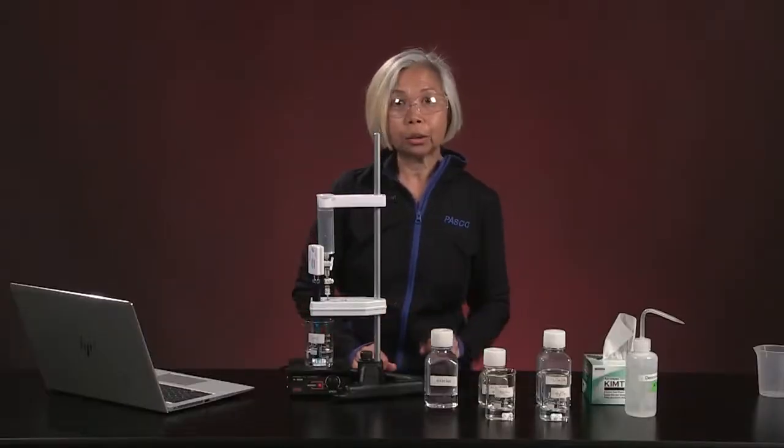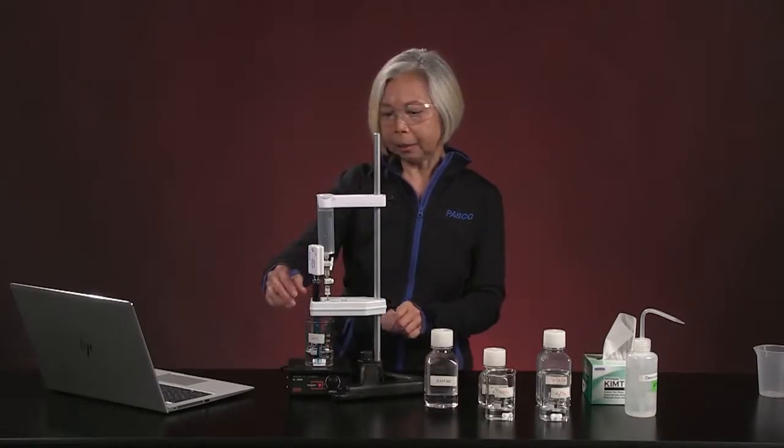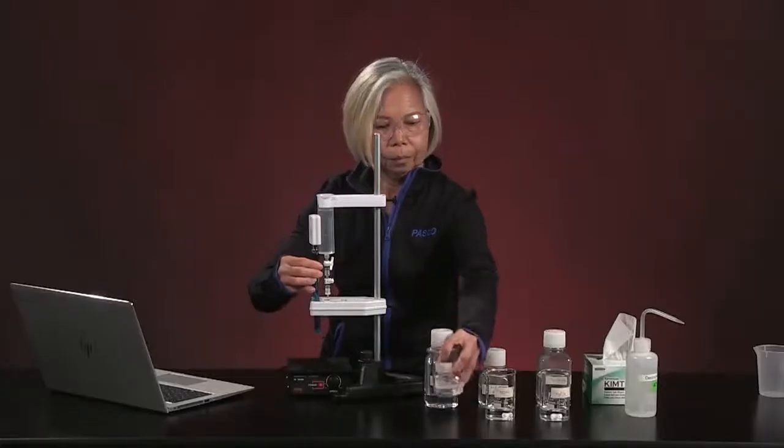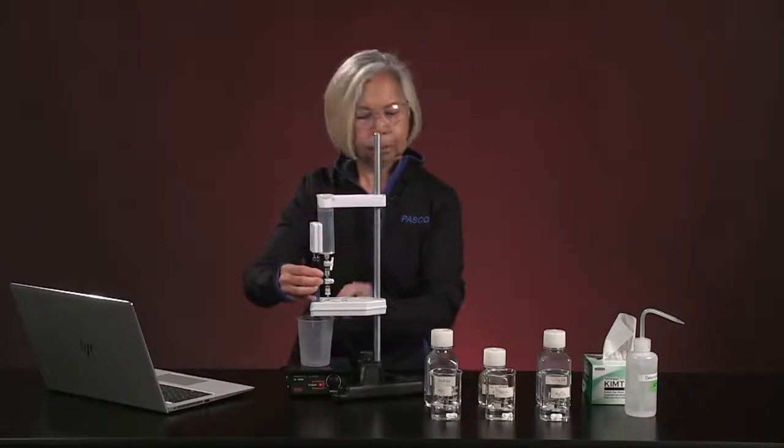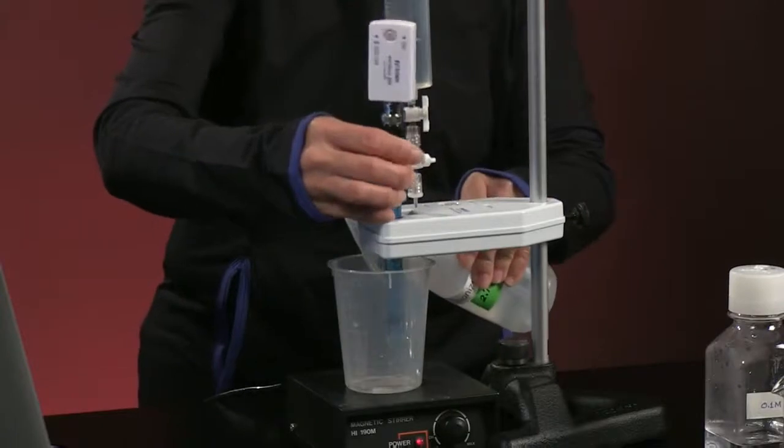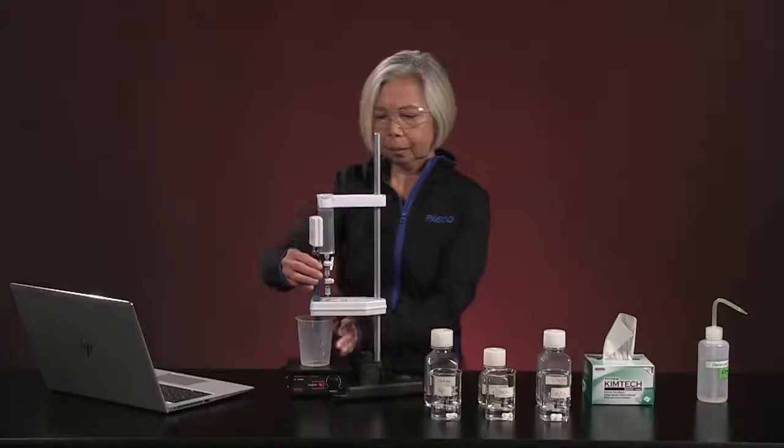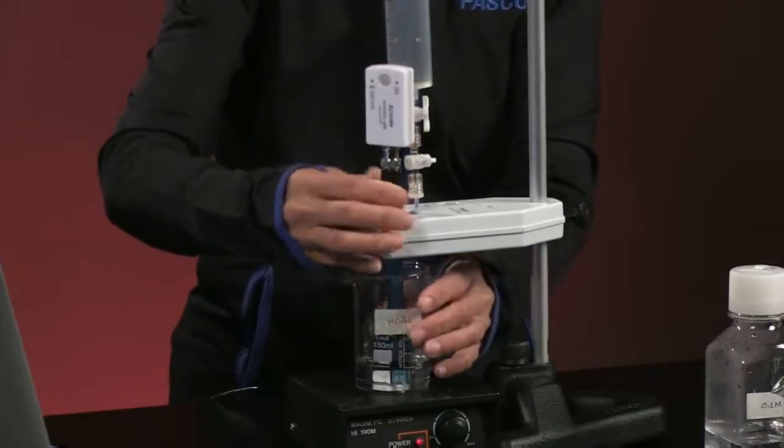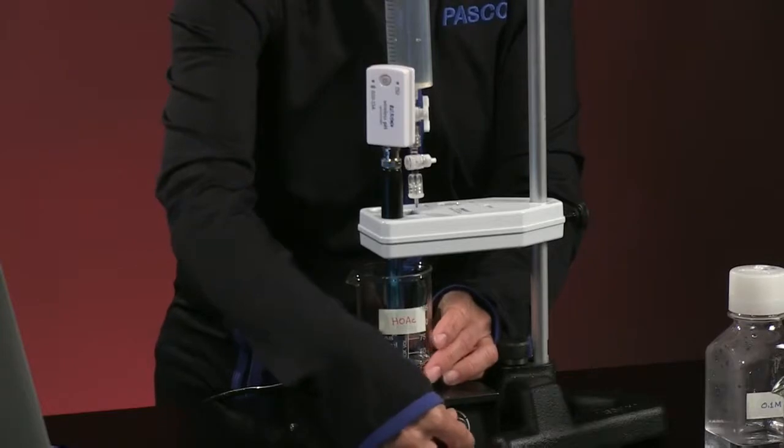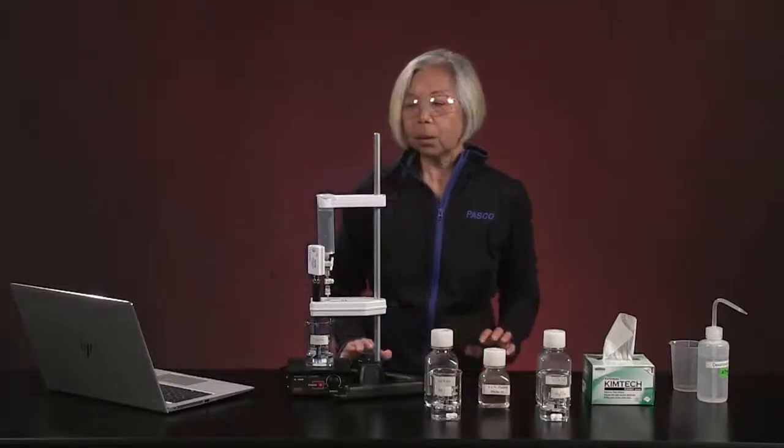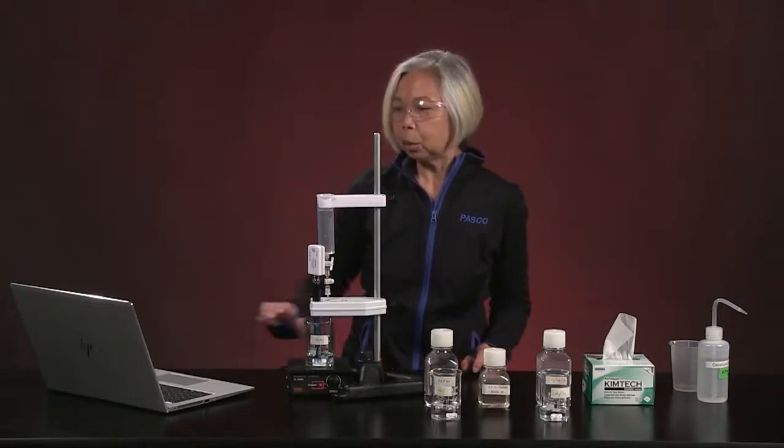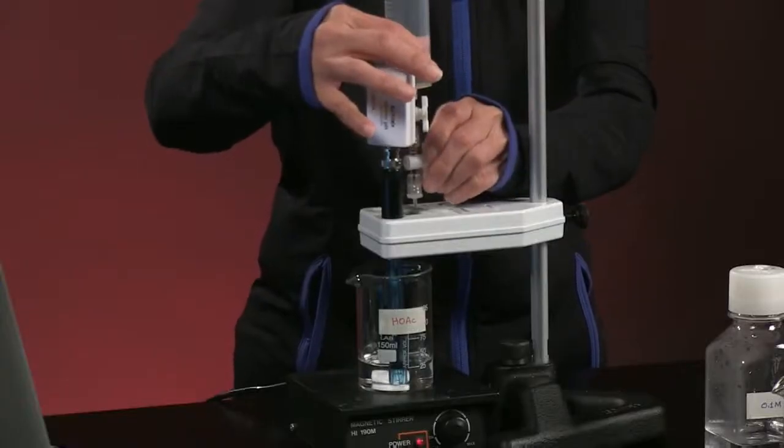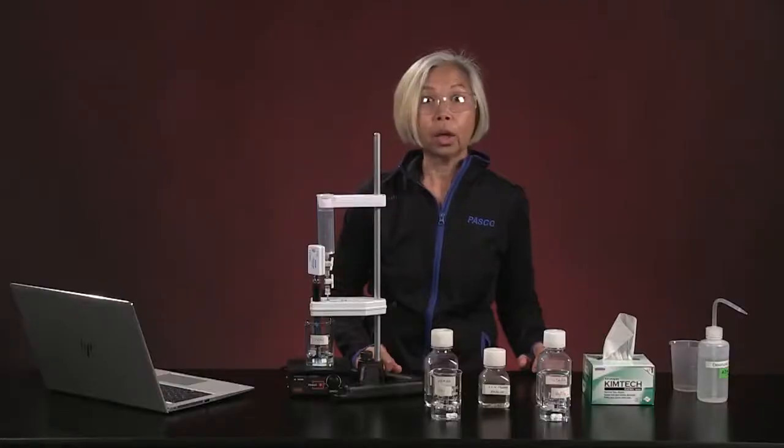We will now shift so that we can do the titration profile of the weak acid, which is acetic acid. We are now ready to do our acetic acid titration. I'm going to press the start button once again. We're going to get a blank screen, and I'm going to turn on our little on-off stopcock. And we are off and running.